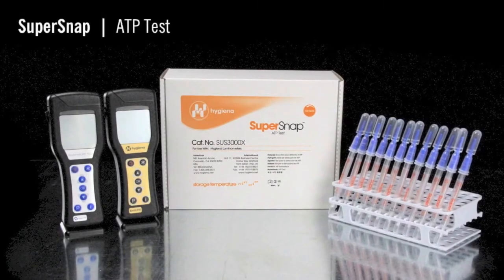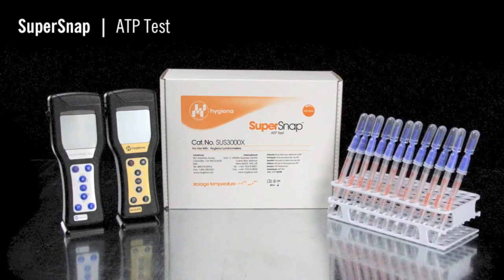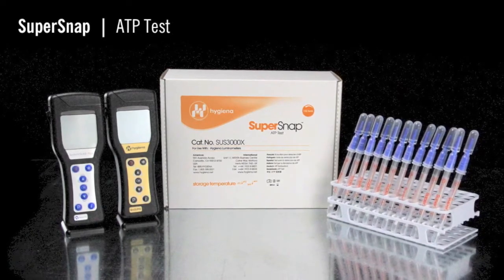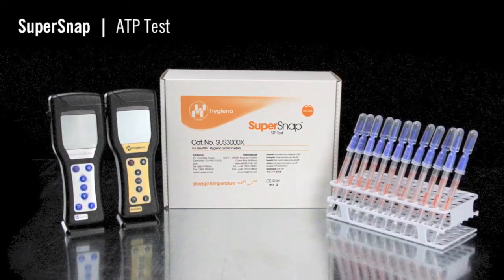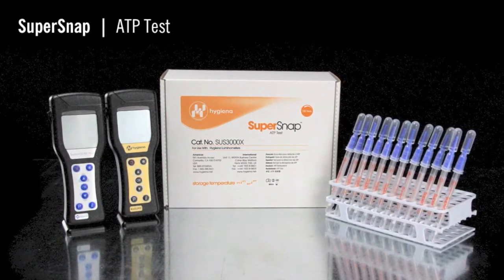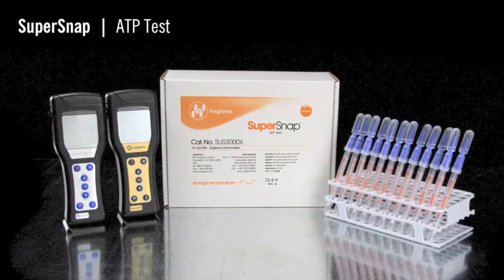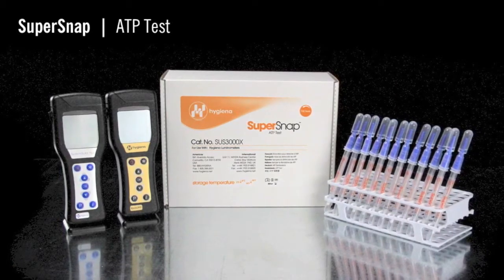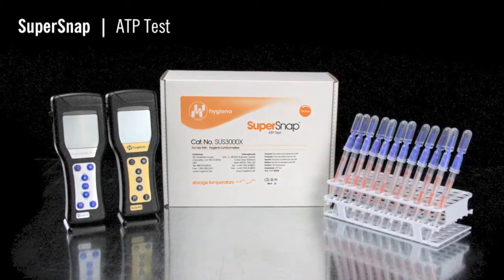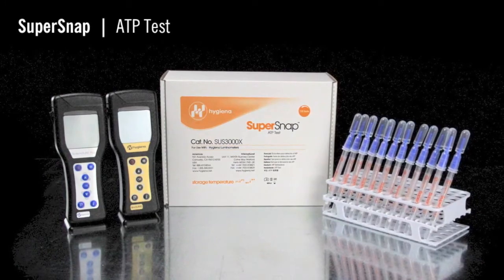SuperSnap is the most sensitive ATP test in Hygiena's ATP monitoring portfolio. The test device detects extremely low levels of ATP, or adenosine triphosphate, and can be used as an allergen cross-contamination prevention tool.